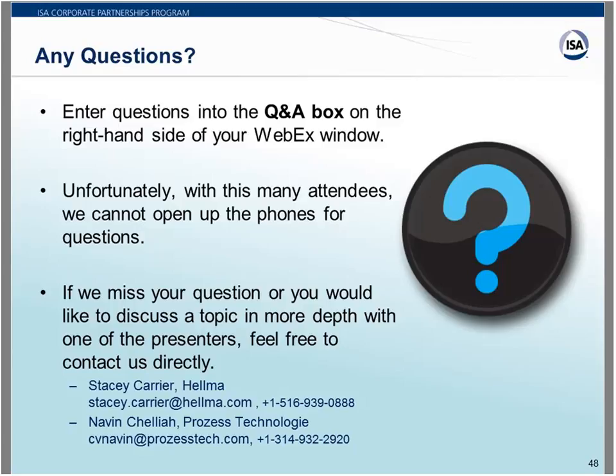What is the spectral range of the instruments? There are different types of spectrometers: UV-visible and near-infrared spectrometers. For UV and UV-visible, the spectral range is between 200 to 800 nanometers. And for near-infrared spectroscopy, the range is between 1100 nanometers to 2100 nanometers.